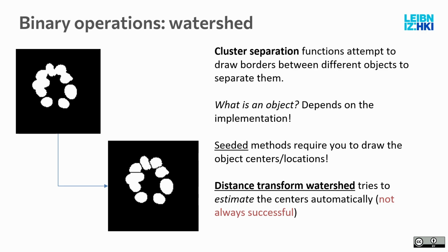Something like Cellpose segmentation can usually solve clusters very well, but it has a complicated setup, and you need more computational resources. But then you get a good clustering out. We might find the time to try it out during the workshop, but I don't plan it because it's quite heavy on the hardware.